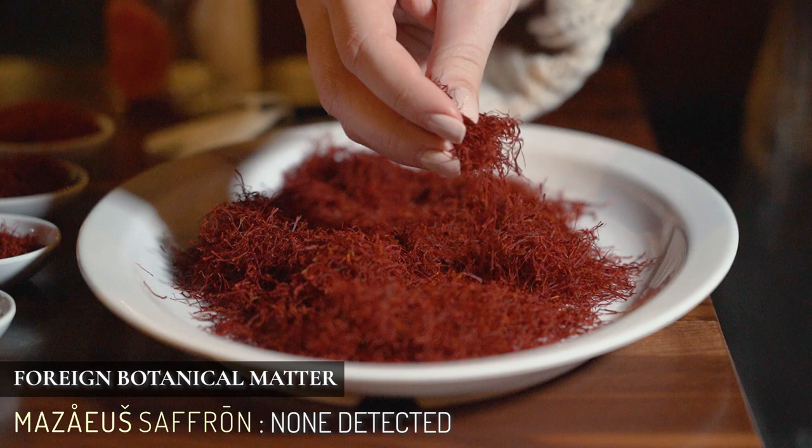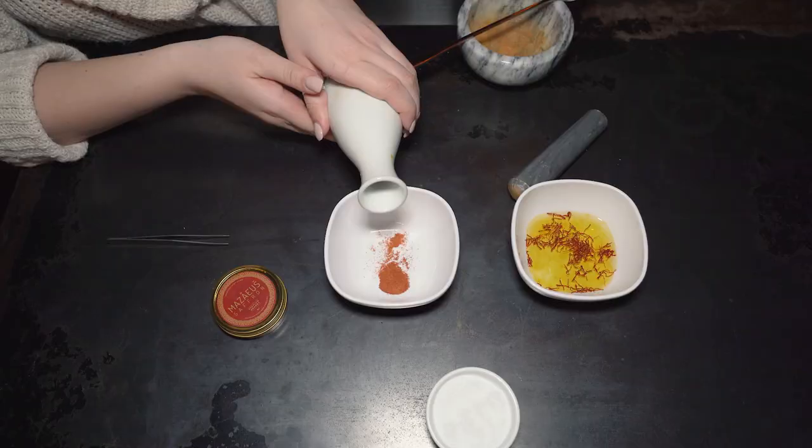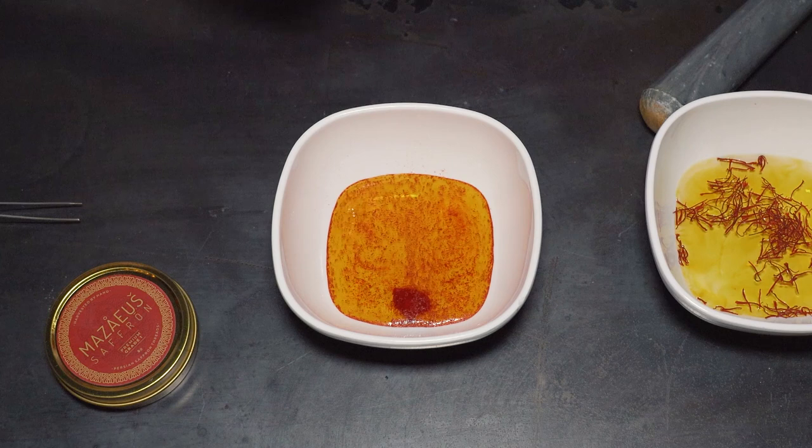Another test is conducted to check the solubility of the saffron. This is important for knowing how much of the natural benefits of the saffron you can extract by steeping, although it does not account for all steeping methods nor all forms of consuming saffron. According to the ISO, solubility in saffron is measured by a max score of 65%.